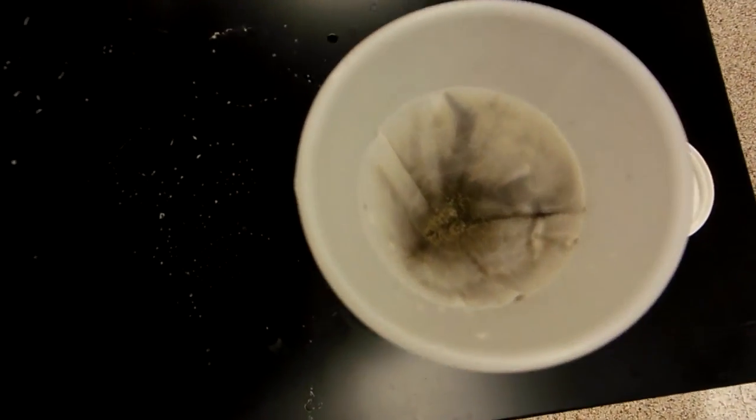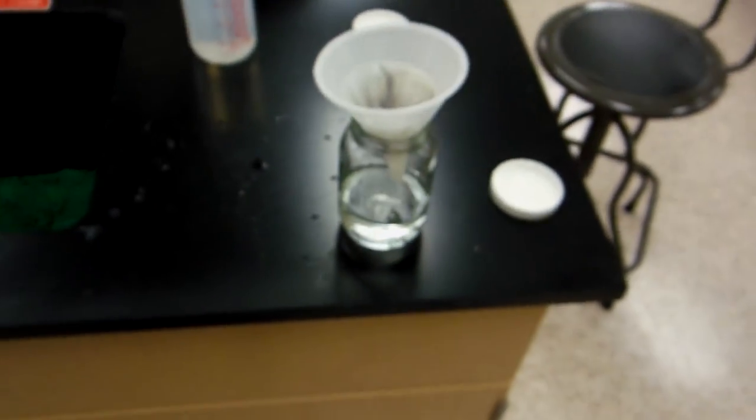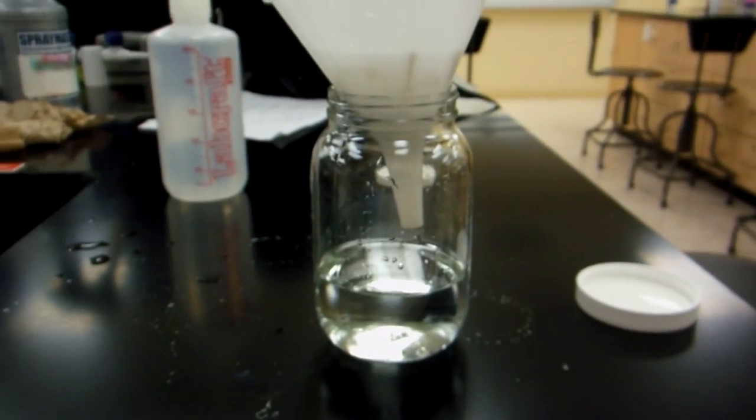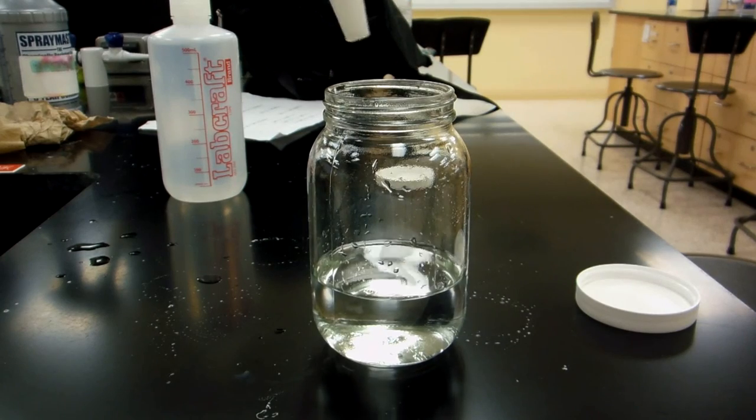Despite the shakiness right now, I hope you can see that there is silver powder present at the bottom. So, yeah, this is also another time-consuming step. There's a lot of impurities that could be stuck in the silver powder. So it's necessary to filter about 5 times. Or even more, preferably as many times as you want. More is better.